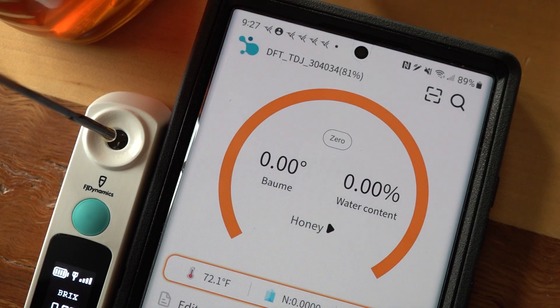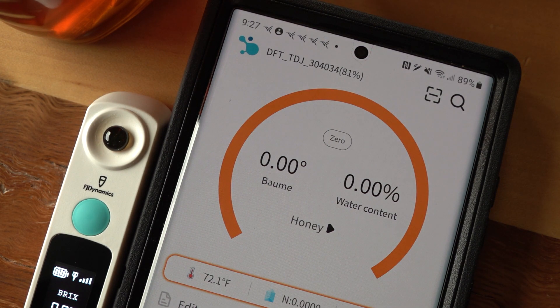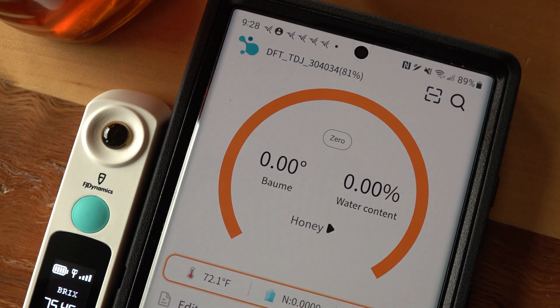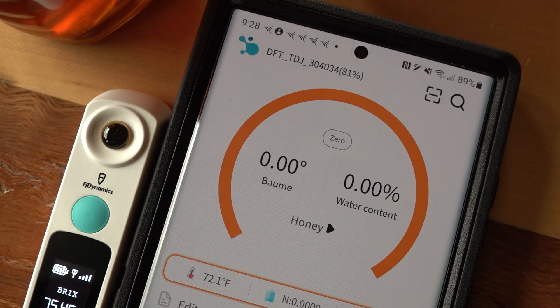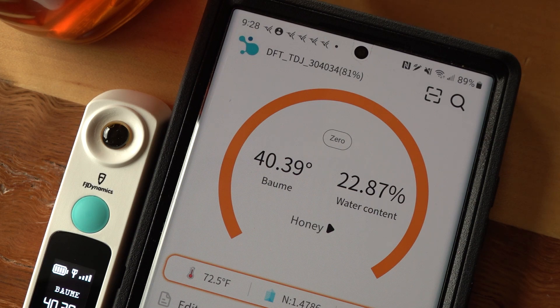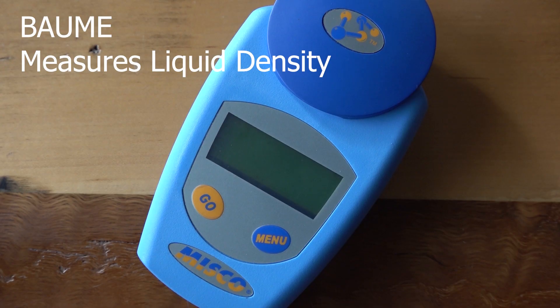Now we're going to put some honey on it and test it. Cover the lens so no light gets around the honey. To know the water percentage I have to click the little green dot on my phone screen. When I do that, it goes into measurement mode — it's measuring honey. The result: 22.87% water content. If that's true, that honey is guaranteed to ferment — that's not good. The honey came from Castle Hives in Lordstown, Ohio, and it reads Baumé at 40.39.